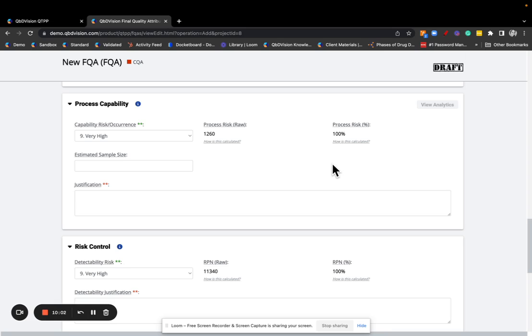The next layer focuses on process capability, or the risk of being out of specification, and is determined by comparing the output of a process to the acceptance criteria. This assessment is data-driven from information imported directly from your certificate of analysis or uploaded using our Excel templates. The View Analytics button will later be activated once this data has been loaded. Be sure to watch the analytics tutorial for more details.